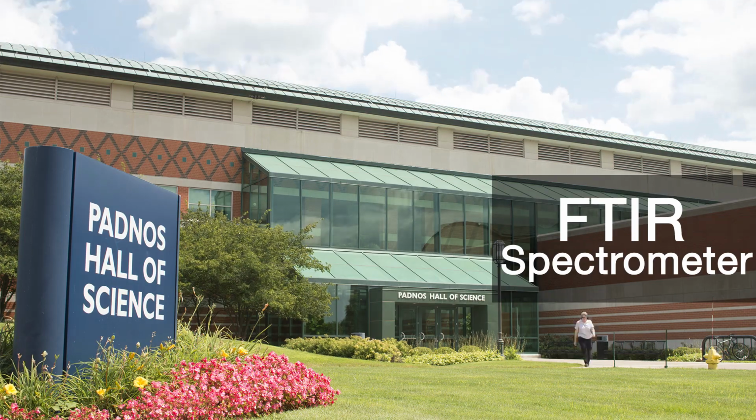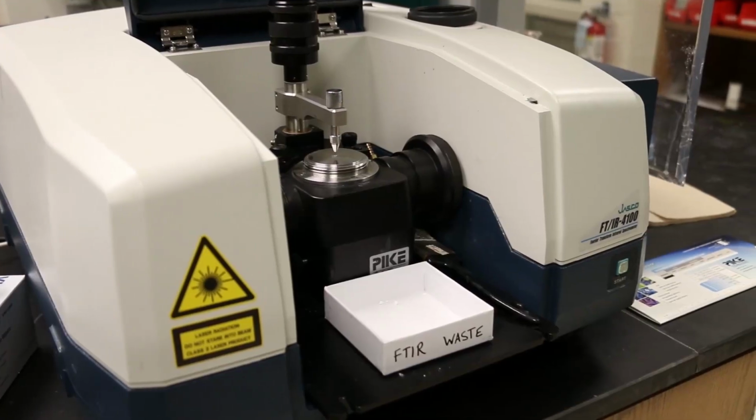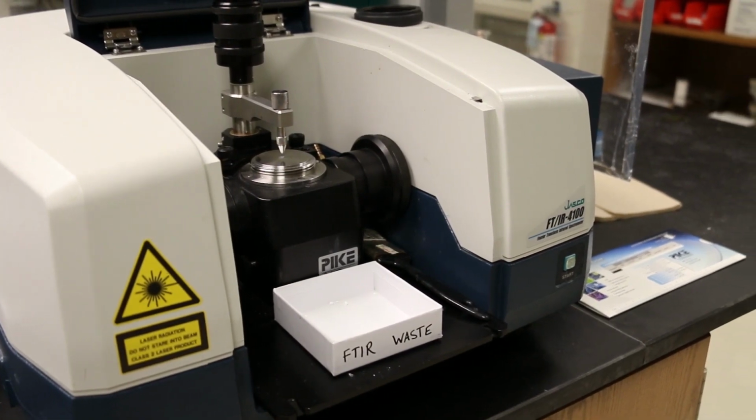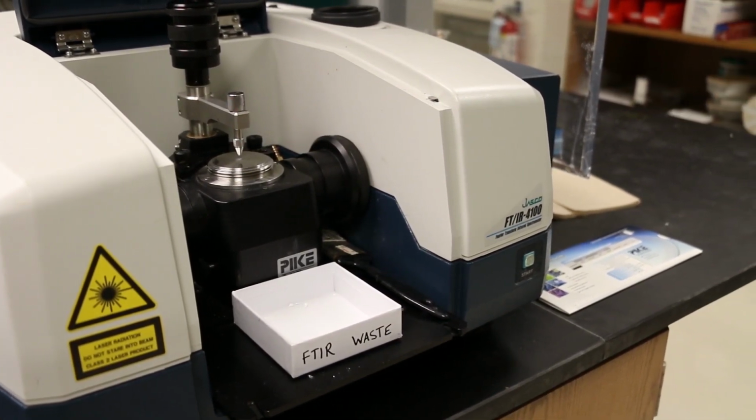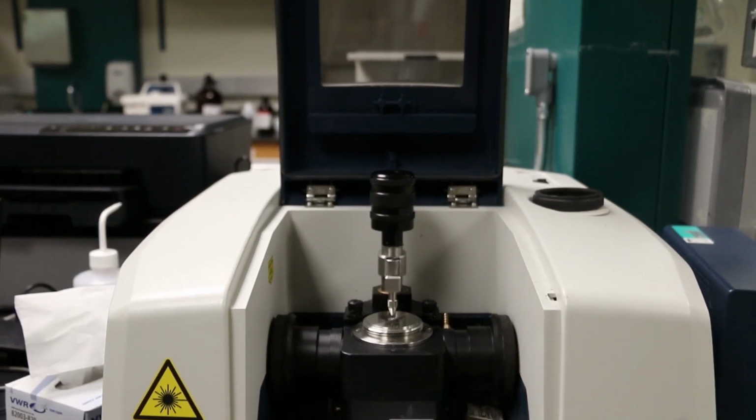This is a video to show you how to use the Jasco FTIR spectrometer. Each organic lab is equipped with a Jasco FTIR spectrometer, and you will use this instrument to help characterize organic compounds that are isolated or synthesized in lab.